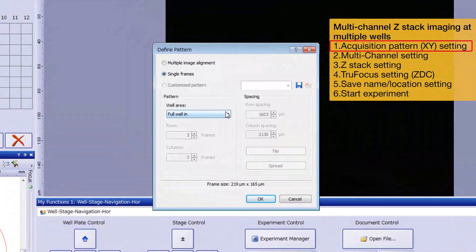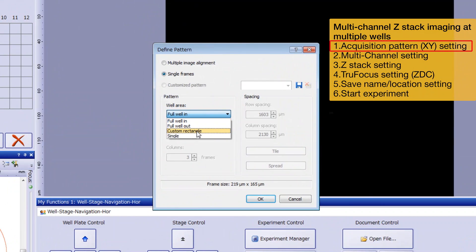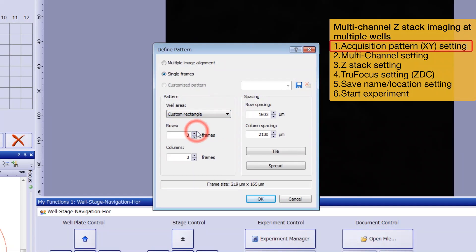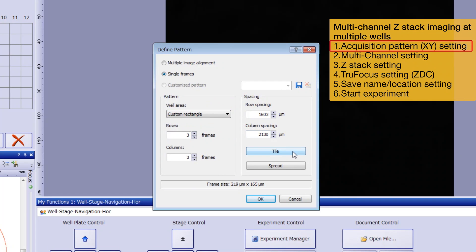Here we'll use Custom Rectangle. In this mode, you can place any number of rectangle-shaped frames in each well. In this example, the number of rows and columns are set to 3. You can also define the space between each frame. If you click Tile, there will be no space. And if you click Spread, the space will be set to maximum. Click Spread and then OK.